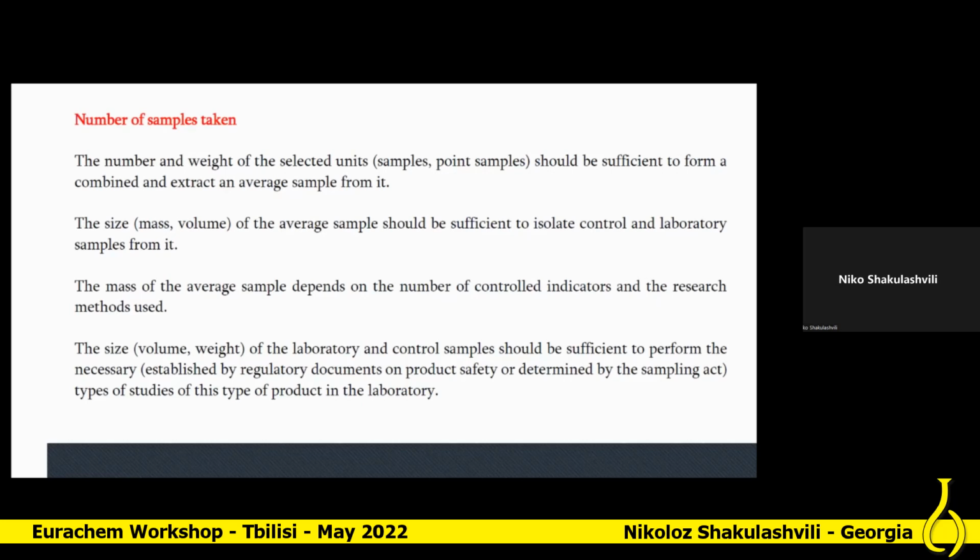When it comes to the size or weight of the sample, it should be sufficient for extracting the samples for a laboratory test and for preservation or keeping these samples for future work. Also, much depends on the parameters with which we will carry out the analysis.